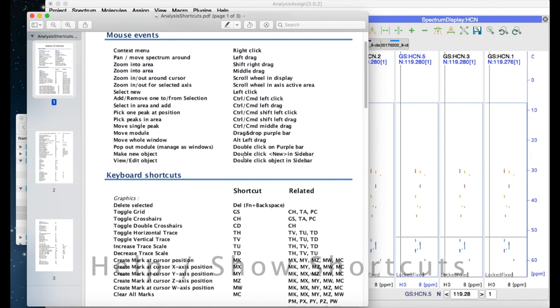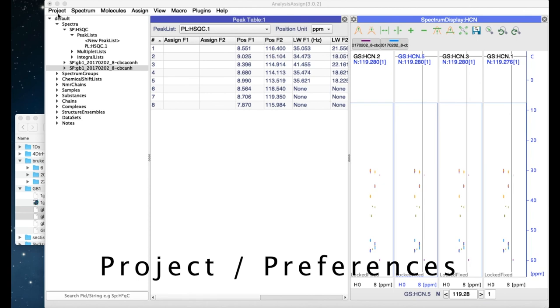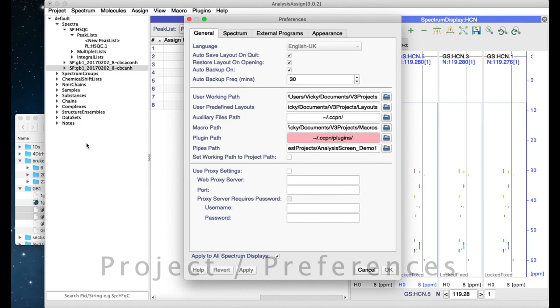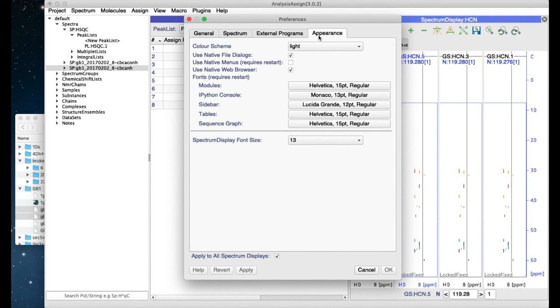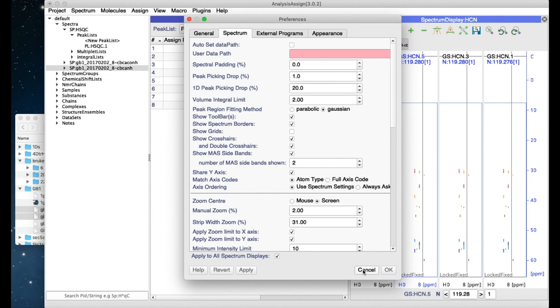And finally, in the Project menu, there is the Preferences pop-up. This has a number of different settings which you can explore and ways in which you can modify the way in which the program works. These are set for you as a user and will apply to all of your projects.